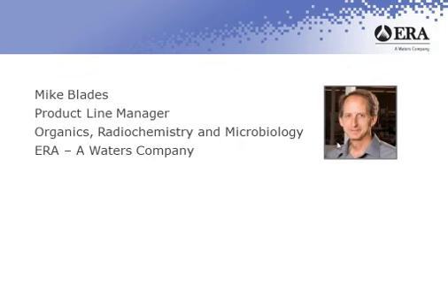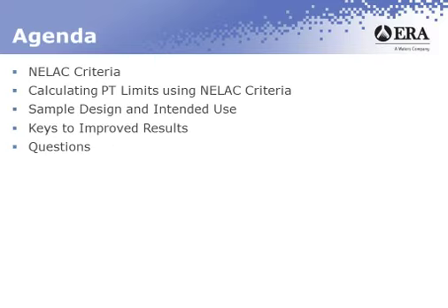Thanks, Tanya. Good afternoon, everyone, and welcome to ERA's webinar on getting better PT results for wastewater micro samples. Today on the agenda, we're going to cover four main areas. The first three: we'll go over the NELAC criteria for wastewater micro samples, we'll go over calculating PT limits using the NELAC criteria, and we'll go over ERA's sample design and our intended use.